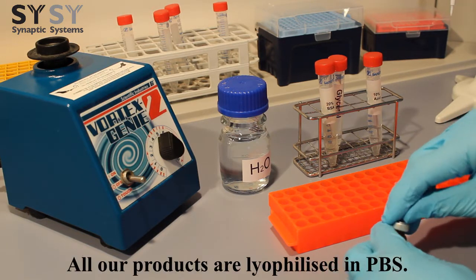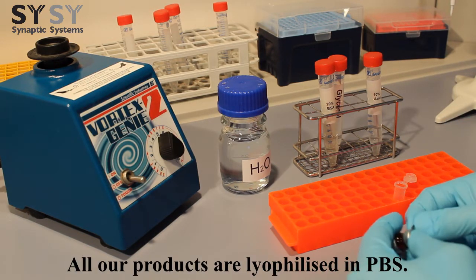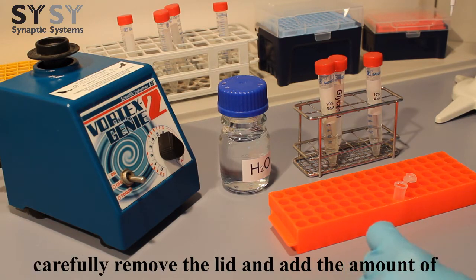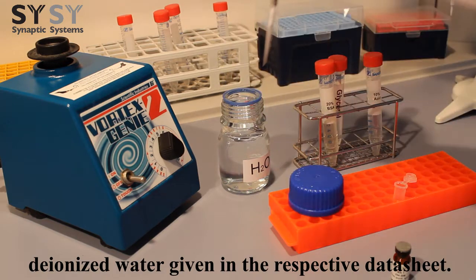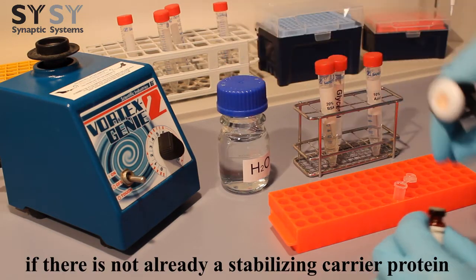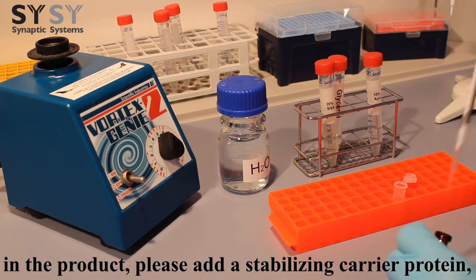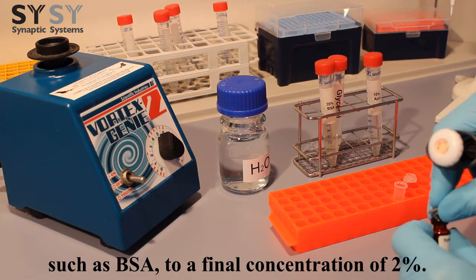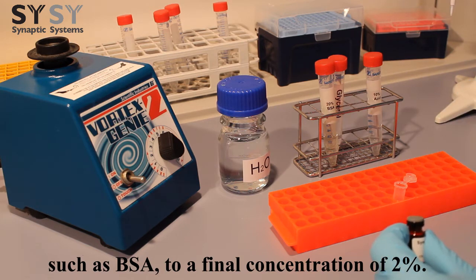All our products are lyophilized in PBS. To reconstitute the antibody in PBS, carefully remove the lid and add the amount of deionized water given in the respective datasheet. Consult the datasheet, and if there is not already a stabilizing carrier protein in the product, please add a stabilizing carrier protein, such as BSA, to a final concentration of 2%.